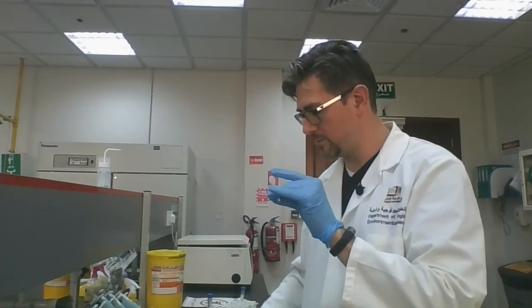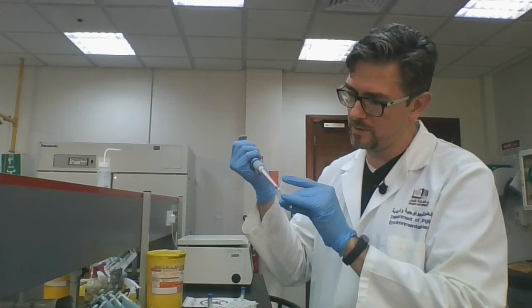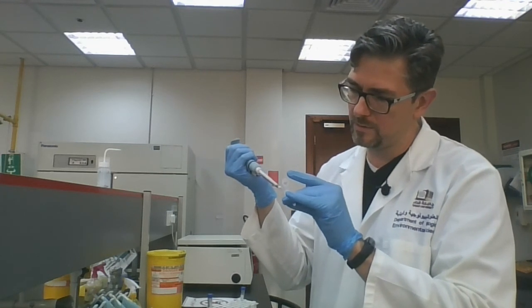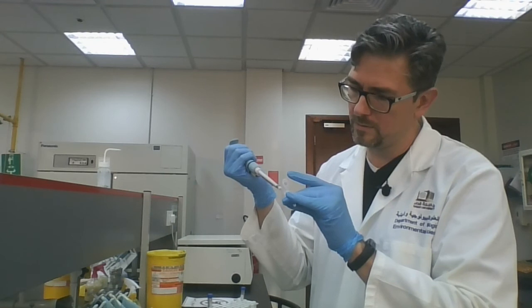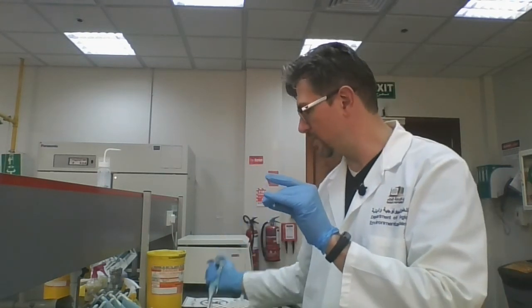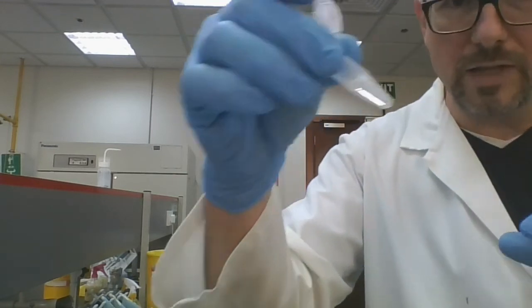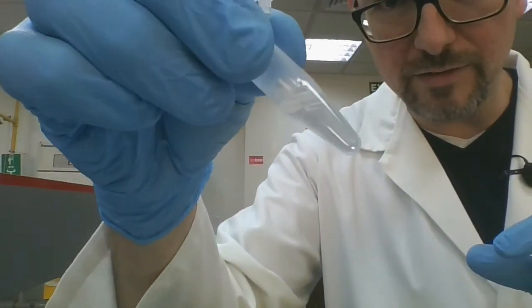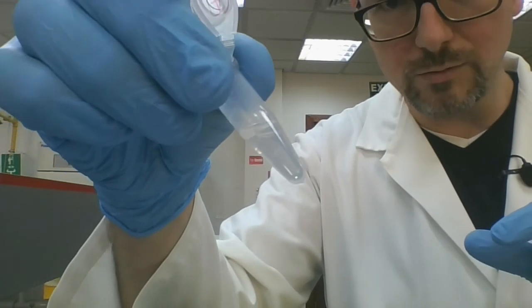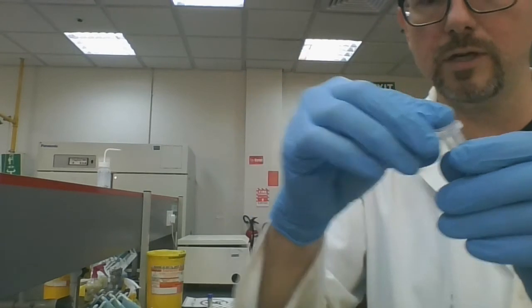Oops, get a new tip. Okay, and again, take up the remaining 150. Okay. So now I have 350 microliters of aqueous phase removed from here. I still have a little bit of aqueous phase left, but you can see just a small droplet at this point. And again, trying to remove that would risk me taking up organic phase, which is why I set a lower volume than 400, okay?